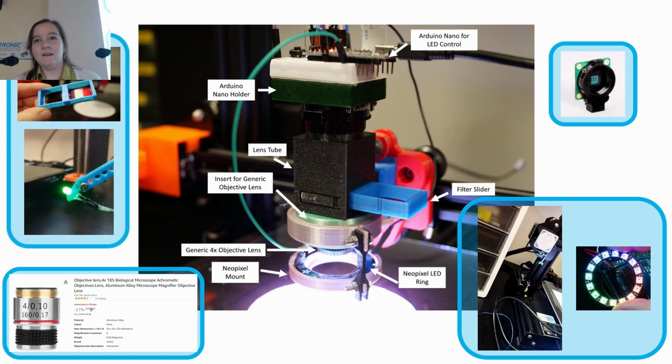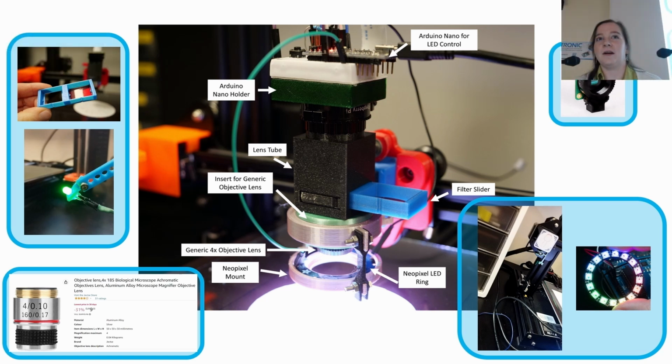And for the fluorescence filter, instead of using the commercial glass fluorescence filters, we use lighting gels, which are thin pieces of plastic that are commonly used in photography or the entertainment industry. And there's a lovely video here, but this red filter blocks out that green light really well. So it can be used for fluorescence with the green light. And then all the other parts, we just 3D print in the middle. So again, just to minimize cost.